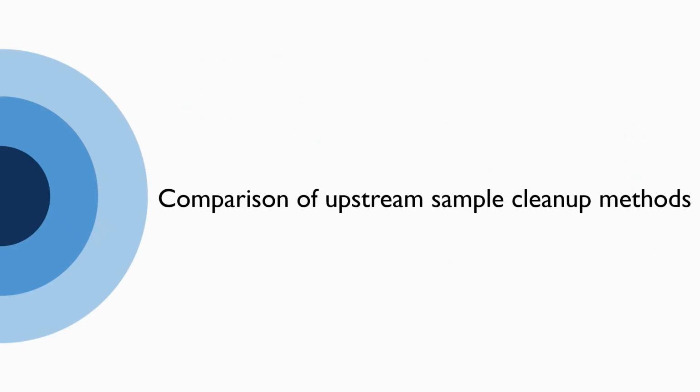Although we now have a tool that can accurately and reliably measure your different AAV populations, is faster to adopt, is easier to run, and also cheaper to operate, this still encounters the same problems that we discussed in one of the previous slides when analyzing upstream samples, which is why we need quick purification protocols to help purify your AAV sample in the crude mix and also to deplete the sample of the impurities.